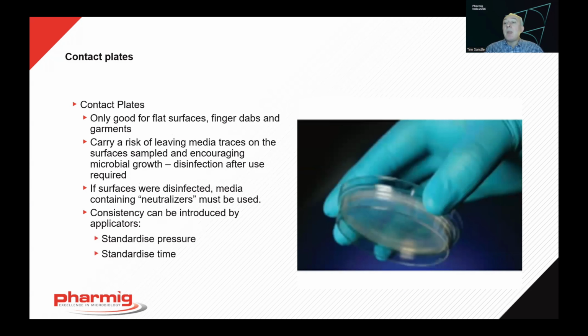Contact plates. Contact plates should contain neutralizers. So even if we're using apparent low residue disinfectants, there's still a chance that there will be some level of residual disinfectant activity, which could lead to false negative counts. So a good all-round neutralizer, effective against the disinfectants that we're regularly using, is important.